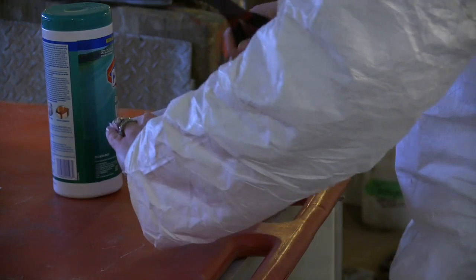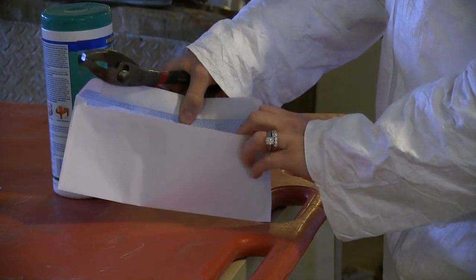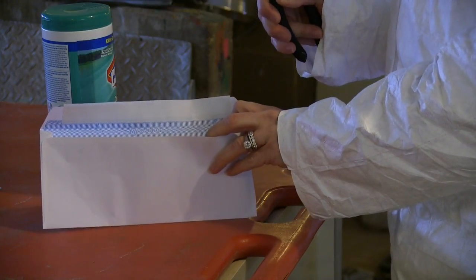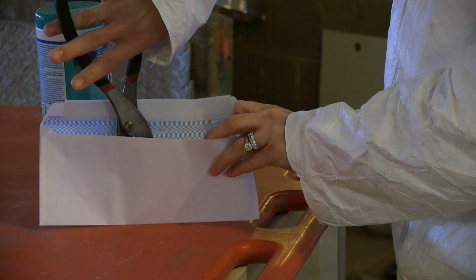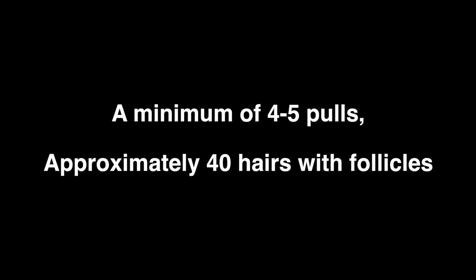Place each sample directly into the self-sealing collection envelope. You'll want to avoid touching the roots or using any plastic bags. Just turn the pliers upside down and gently shake them into the envelope to let the hairs fall down into the envelope. Again, you'll want to do about five pulls in order to get a minimum of 40 hairs with follicles in the envelope.